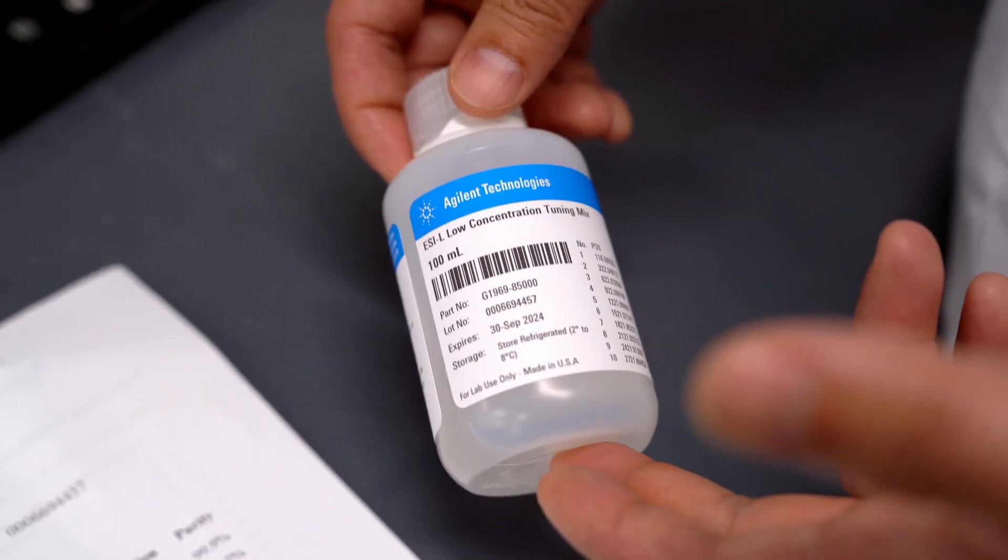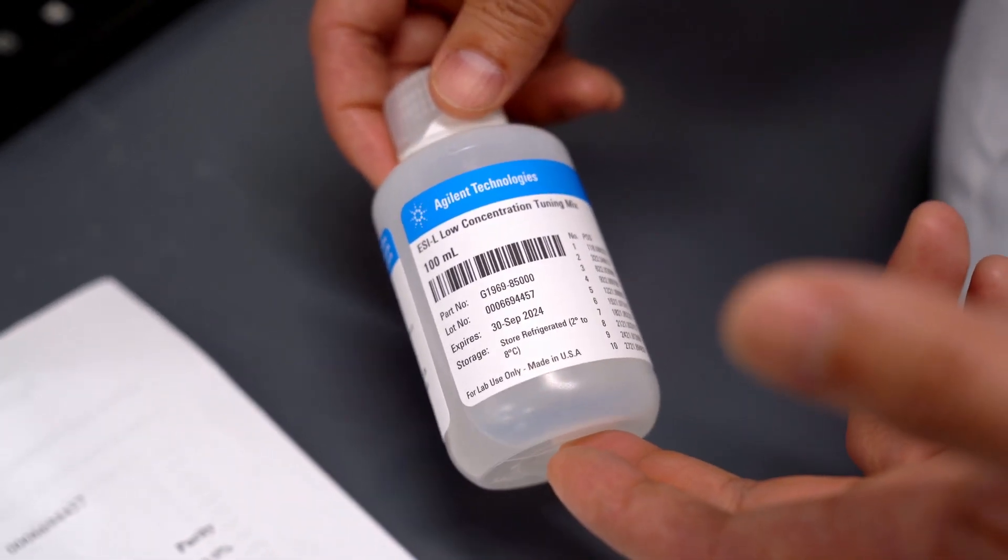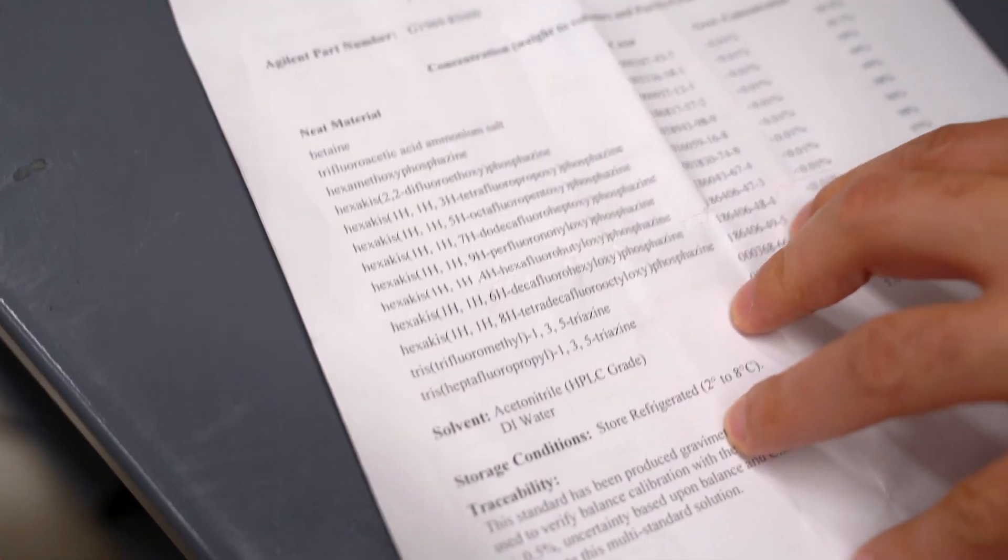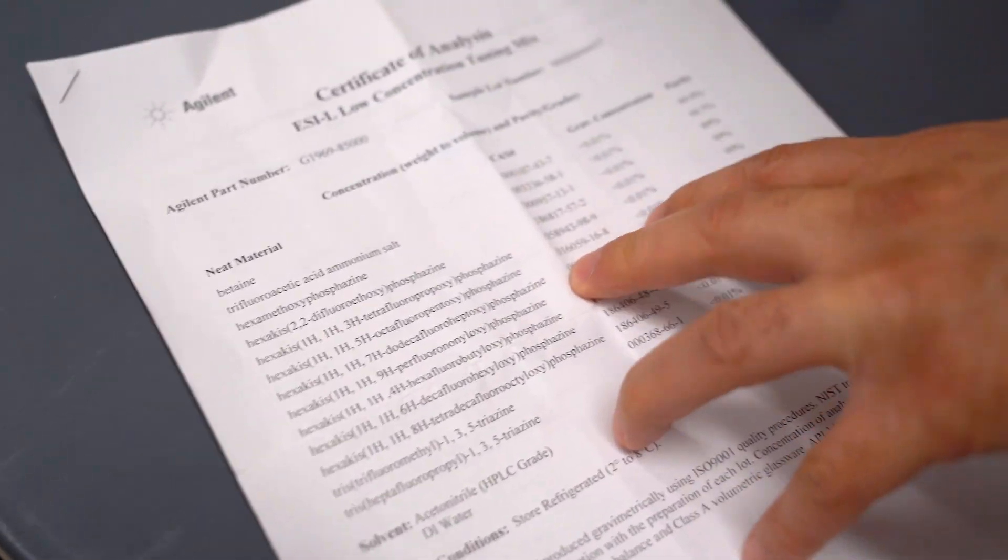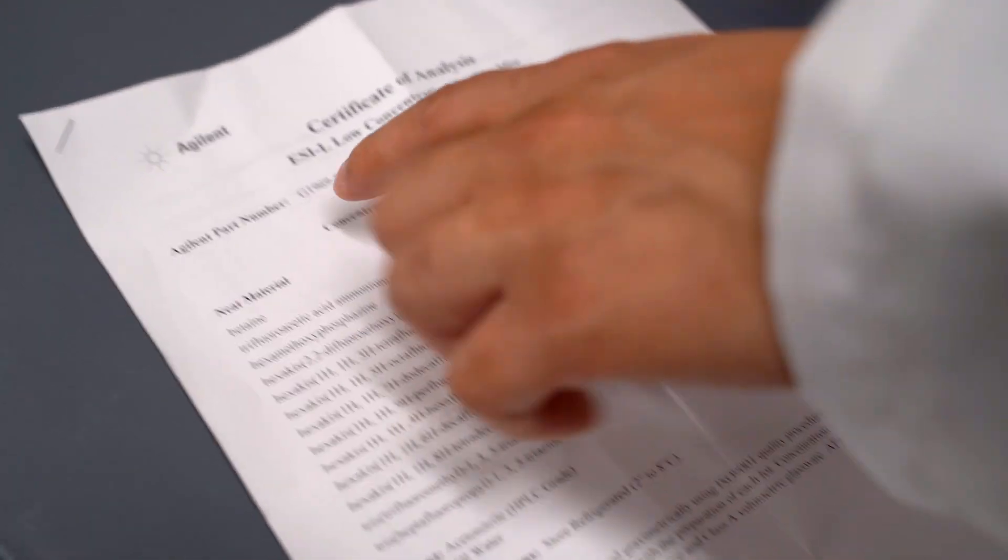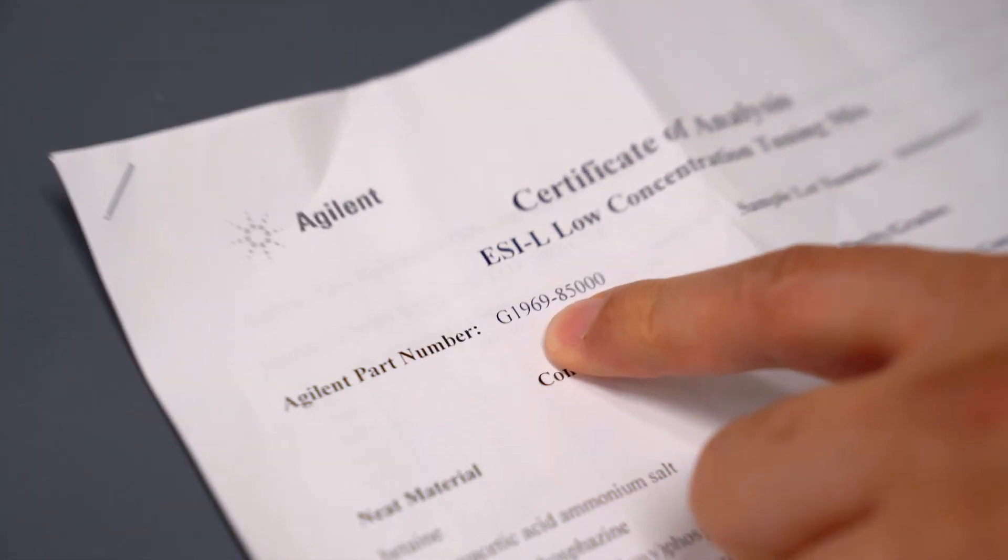This is the mass spec tuning solution right here. It's a mixture of these compounds which are some phosphazines and triazines. The part number is listed right here.